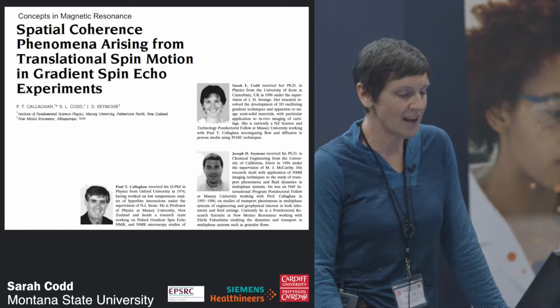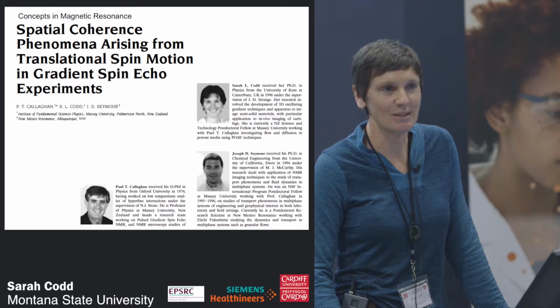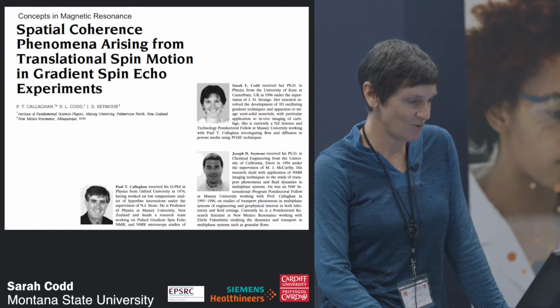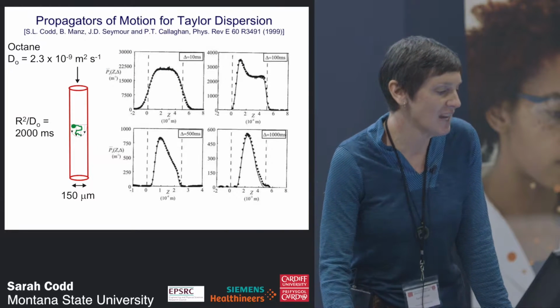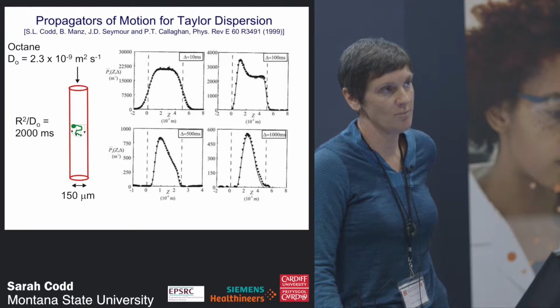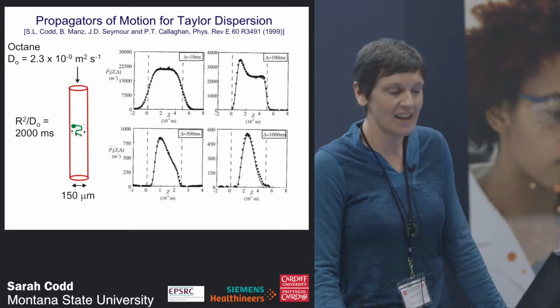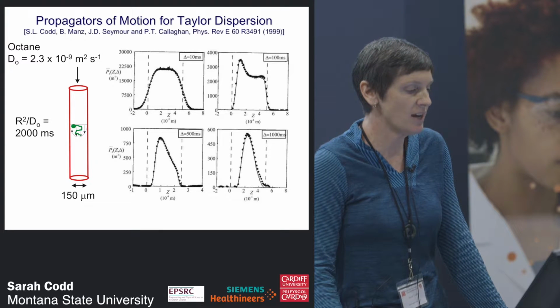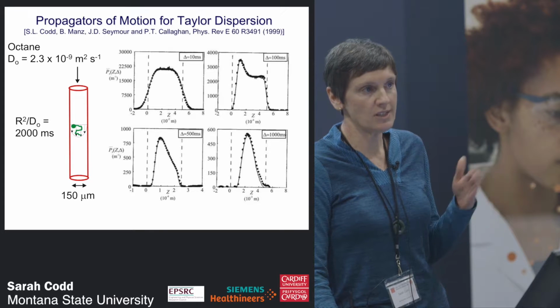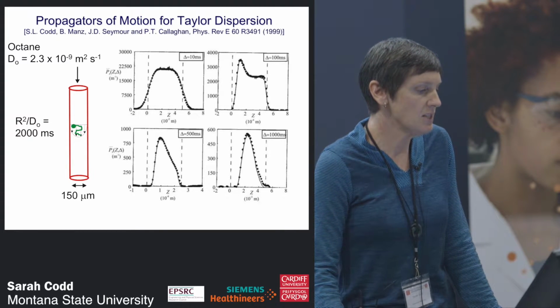So it turns out that about a year and a half later, I actually managed to get that data. It wasn't quite as easy as Joe at first thought. And much of the challenge came with trying to find ourselves in the right time and space window that the PGSE experiment allows. But in the end we managed to get this data, and it was a really nice way to discuss the ideas between what you could observe in Q space and where that came from based on the propagator.